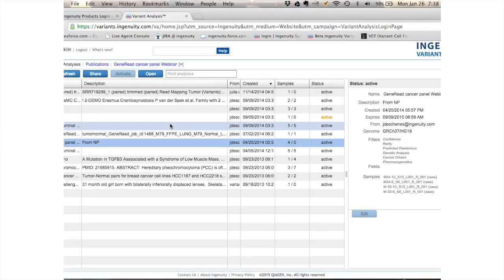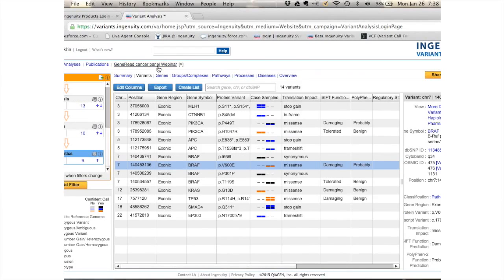The length of running the analysis can be a few seconds, a few minutes, to, typically if you're talking about 200 whole genomes and things like that, it could go to a few hours, 200, 300 whole genomes. But it's nice because it's allowing you to do that interpretation fairly quickly on the web, so it's securely transferred to a secure server. And when your analysis is ready and loading, this is how you see it.